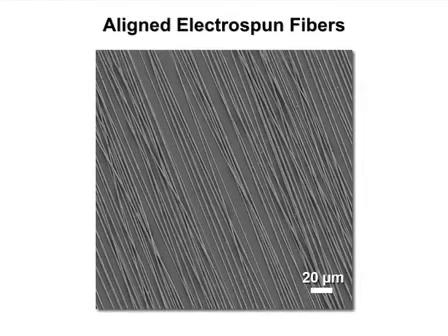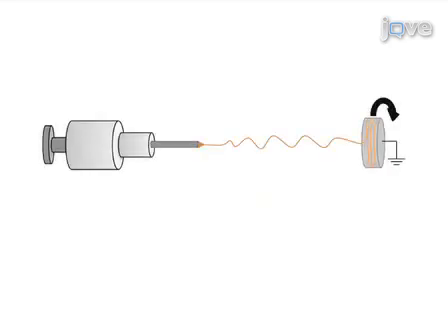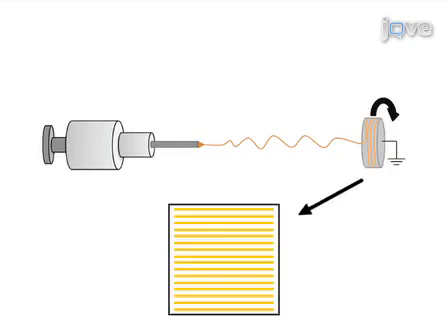Aligned electrospun fibers direct the growth of neurons in vitro and are a potential component of nerve regeneration scaffolds. Here, electrospun fibrous scaffolds are generated, and primary rat sensory and motor neurons are grown on them. First, fibrous scaffolds are electrospun onto glass cover slips.